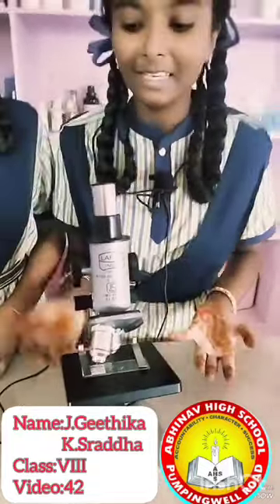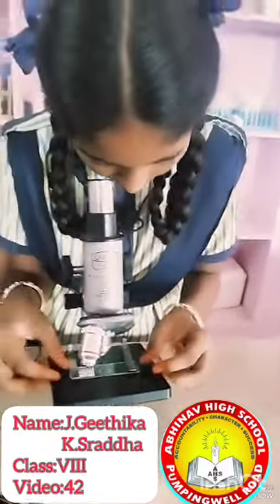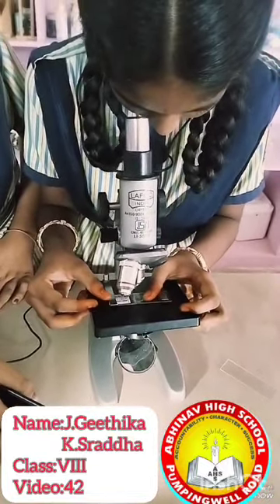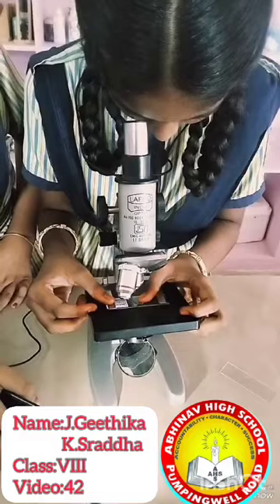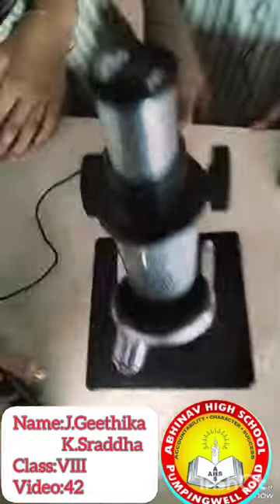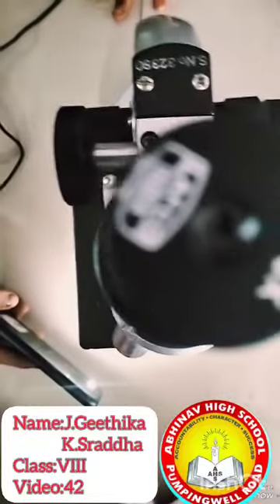Now I am seeing it under the microscope. You can also observe it under a microscope. It looks like small structures.